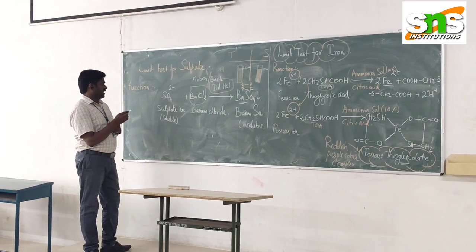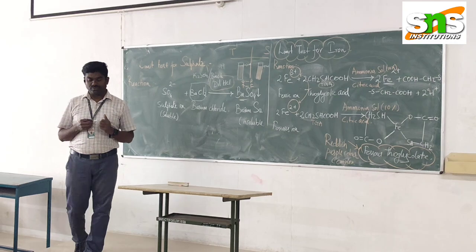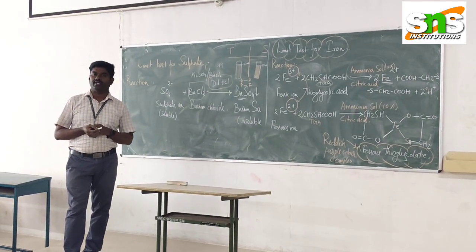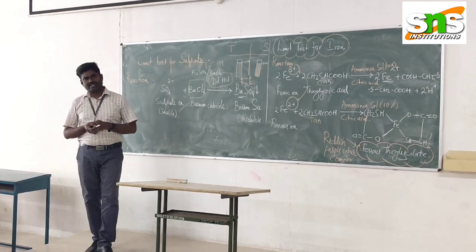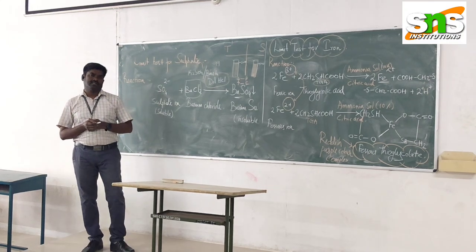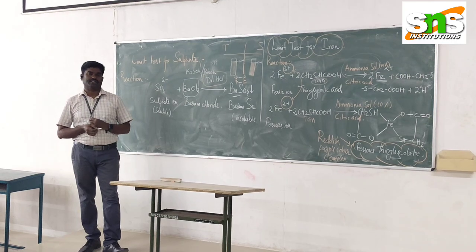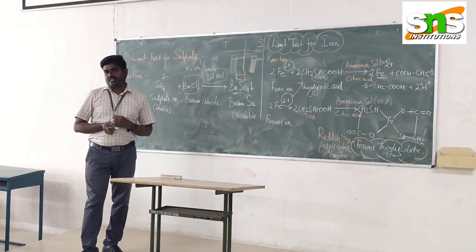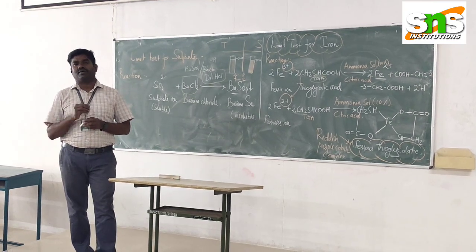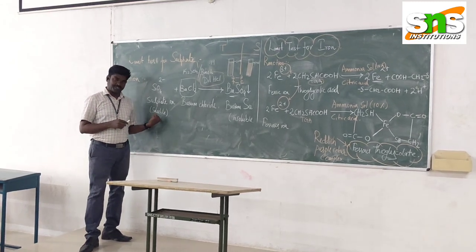These sulfate ions are present as an impurity in pharmaceutical formulations or API, active pharmaceutical ingredient. So how do we control this sulfate, or how do we determine the quantity of the sulfate ions? With the help of these concepts, we can estimate it. In the limit test for sulfate, the sulfate impurities are present in the form of sulfate ions, which are soluble in nature.